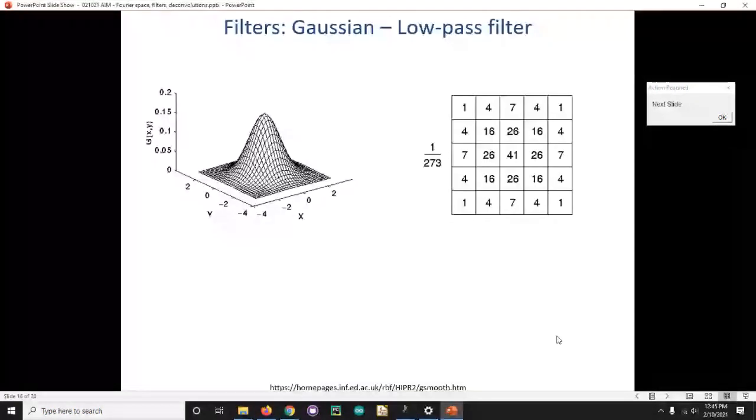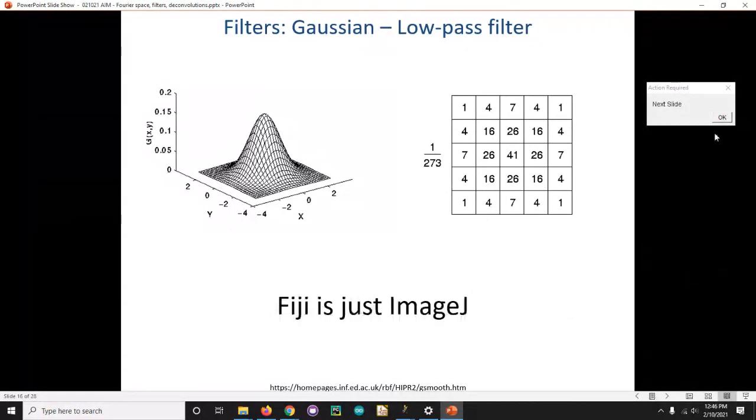So next we're going to get into one of our first filters in ImageJ, which is the Gaussian blur. And Gaussians are very special when it comes to Fourier transforms. It also goes with how do we do a perfectly apodized filter. And the key thing with Gaussian functions is Gaussian functions are perfectly reciprocal in Fourier space. So the Fourier transform of a Gaussian function returns a Gaussian function.